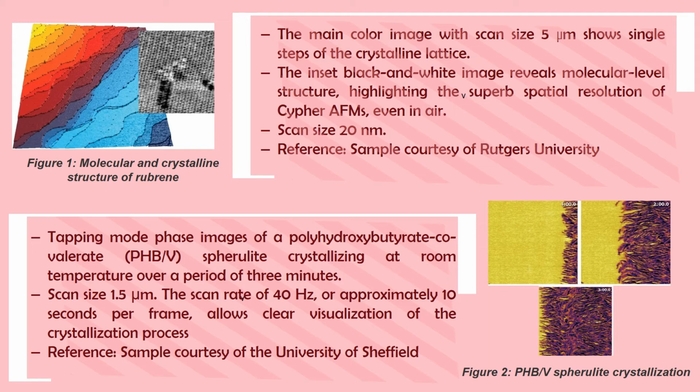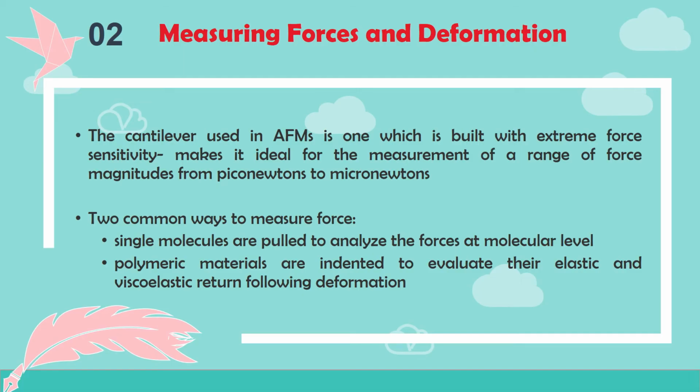Smaller cantilevers have higher resonance frequencies. They are also able to provide improved resolution and control for very small forces in the sub-piconewton range, which is extremely crucial when investigating polymers, which are delicate and easily undergo deformation. Second, measuring forces and deformation.